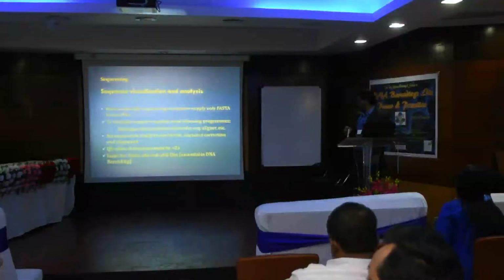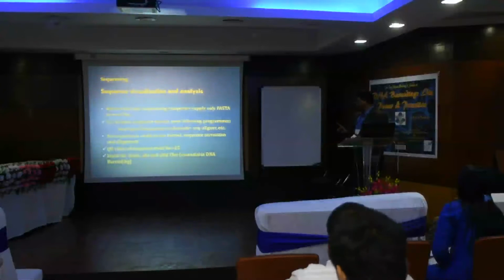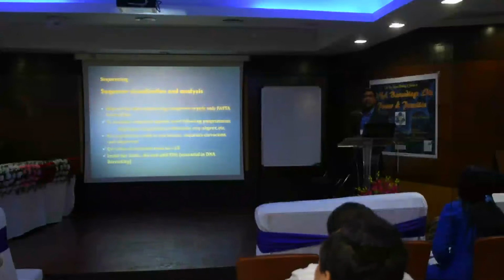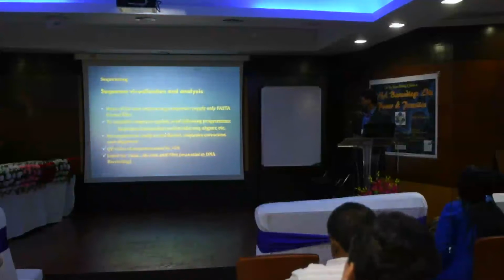You usually need these programs. These include SequenceScape, Sequencer, CodonCode Aligner, a lot of programs. But I will not refer to any program. Sequencer is very bad. You can play anything there. Usually don't allow your students to work with Sequencer. Sequencer is like an open access, open platform. You can make any change in that.